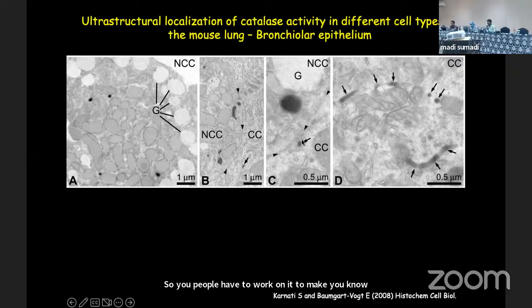And you see, these are the two structures of the peroxisomes that you see with the TEM. I thought, okay, they're round, which is what is in the literature, but I also see very nice elongated peroxisomes. You cannot see that with any other method. You can see the protein in a Western blot, but you do not know whether it's round or elongated or tubular. You see structures only with this. So we see very nice round ones here, and here the elongated peroxisomes.